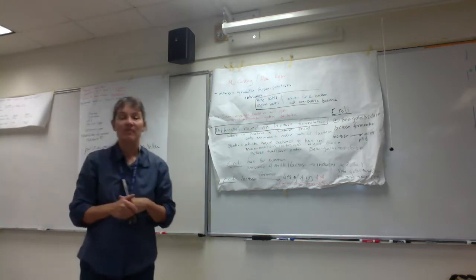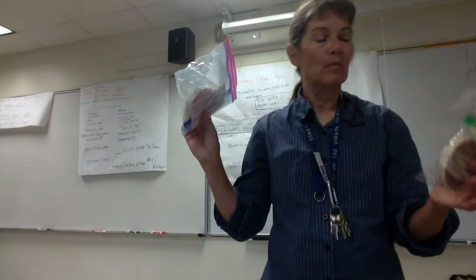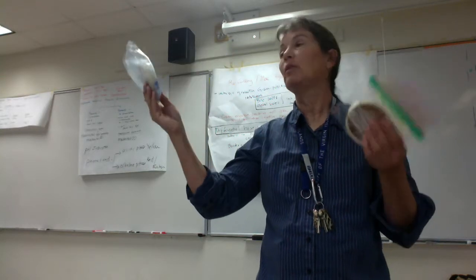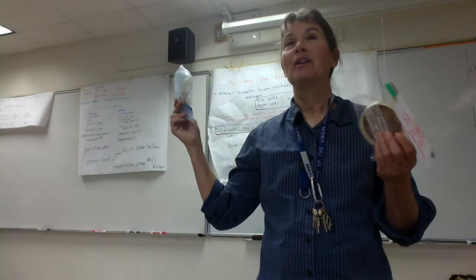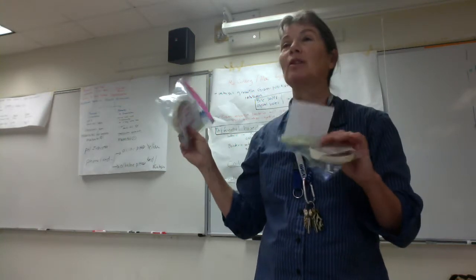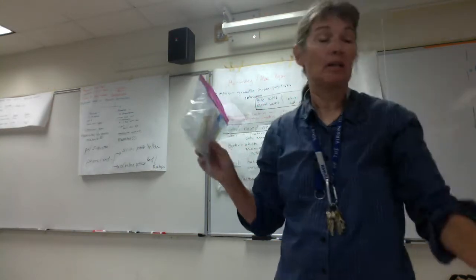Okay, folks, we've got our nose swabs and throat swabs up here. We've double bagged them, you guys, because what have we done in growing those little darling pathogens on our blood agar? We've amplified them, right? So we don't want you opening the bags. Hold them up to the light so you can see the different types of hemolysis.